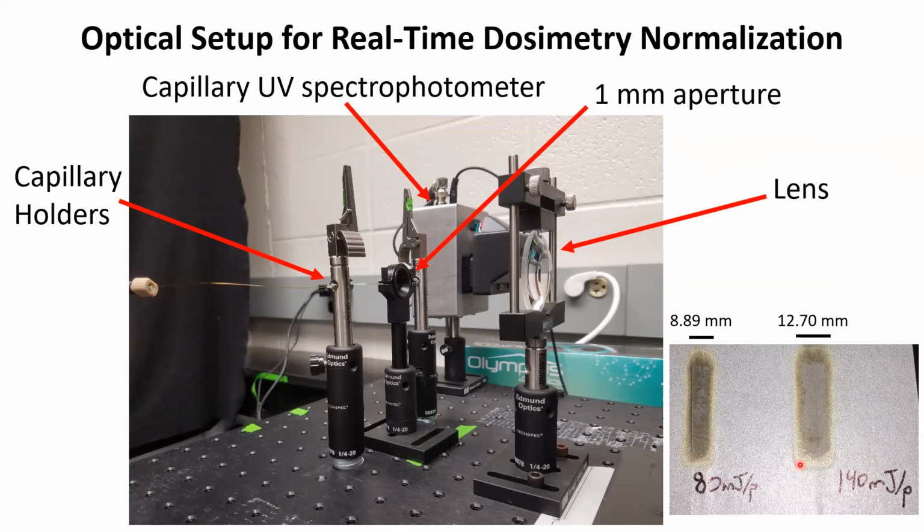Now, if you think back to our introduction to FPOP, you'll remember that in FPOP, we carefully measure the profile of the beam and then time the flow rate of our solution through the capillary to ensure that each and every volume of sample is only illuminated by a single laser shot, with an exclusion volume, or an unirradiated volume, in between each laser pulse.